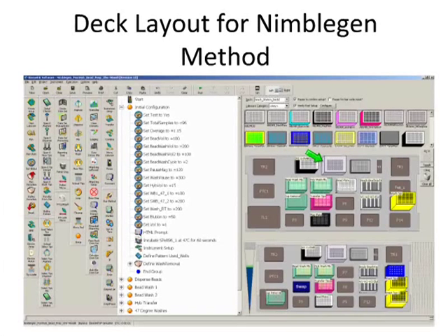And then this is the tip wash station. I did notice there was a question asking what steps we need the tip washing for. We find the tip wash is just a way to save on plastics and save on tips. By washing the tips in between steps using the tip wash, we can use the same tips more than once. We've done extensive contamination screening for that, and there is absolutely no cross-contamination between tips.